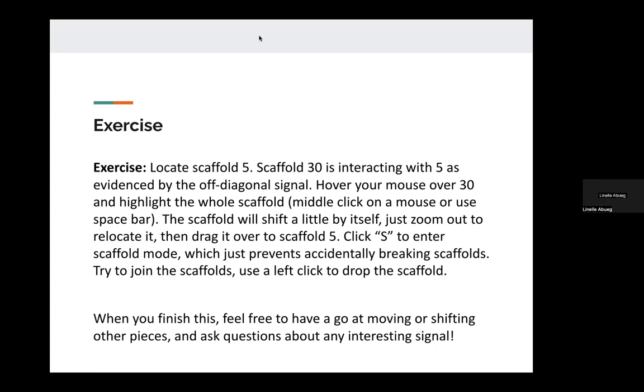And I think everyone has pretext now. Everyone has pretext installed now. Great. Okay. So does everyone have the map loaded? I think some people have. Great. I see thumbs up. We're good. Okay. Go ahead and give this exercise a try and take a few minutes.